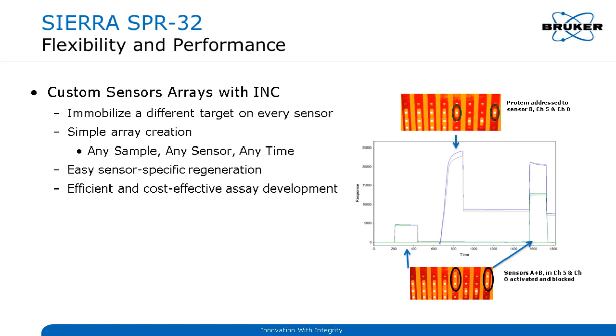If you look at the high refractive signals themselves, if there were any leakage to the sensors below, you would see a signal coming up from the baseline, as the signal of all 32 sensor spots is collected at all times.